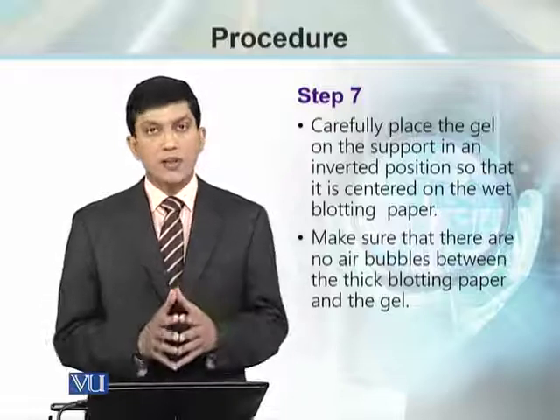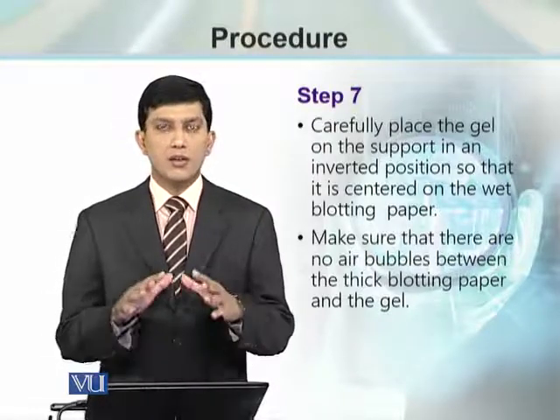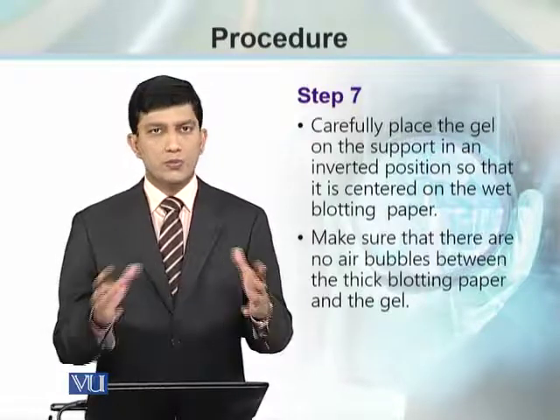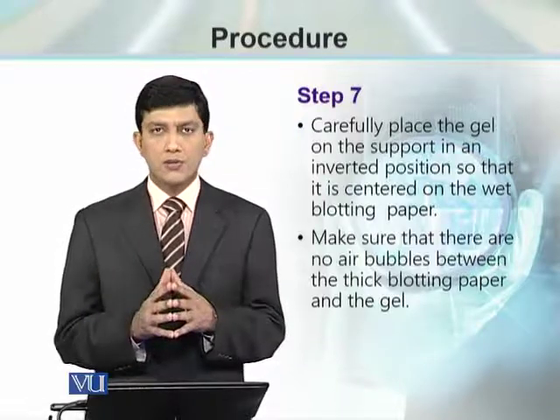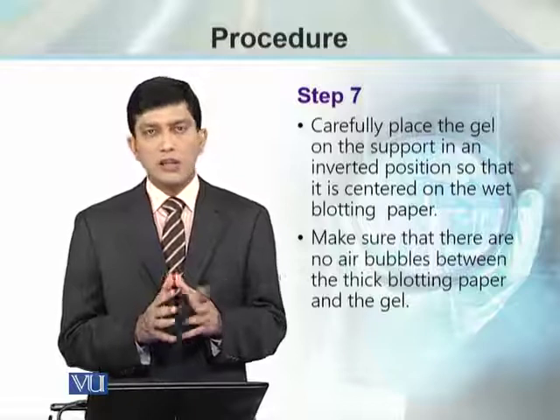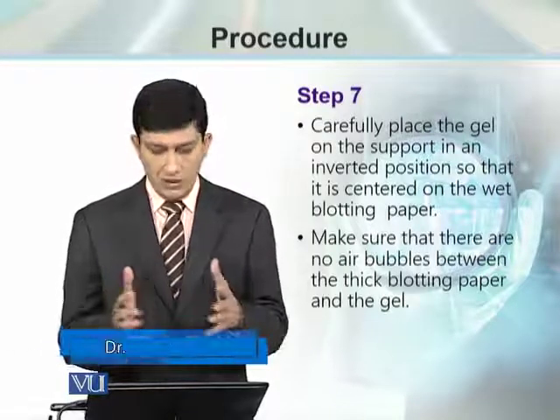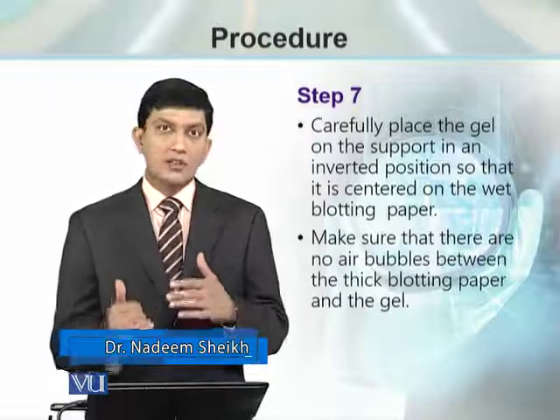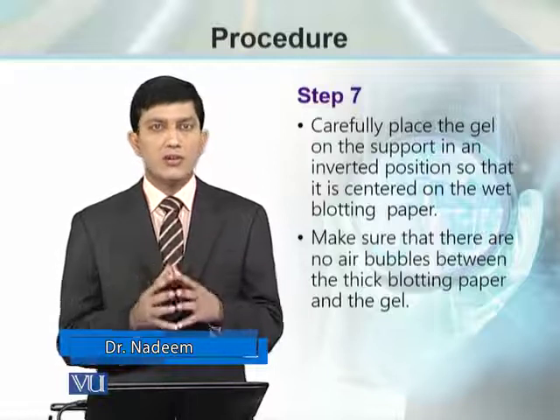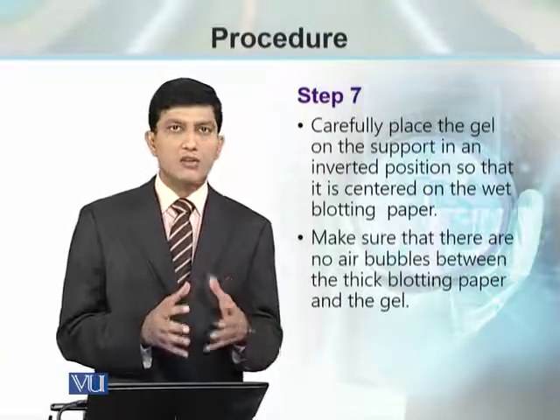फर्स्ट 6 स्टेप्स की हमने पिछले मॉड्यूल में बात की, जिसमें हमने बात की कैसे ग्लास प्लेट को, कैसे रेजरवायर को, उसके ऊपर एक फिल्टर पेपर को विद ड्रिपिंग edges in the buffer, and then gel is placed upside down. What is next? What we have to follow step by step. At every step there are some points. If they are ignored, then the problem is going to come in the transfer.